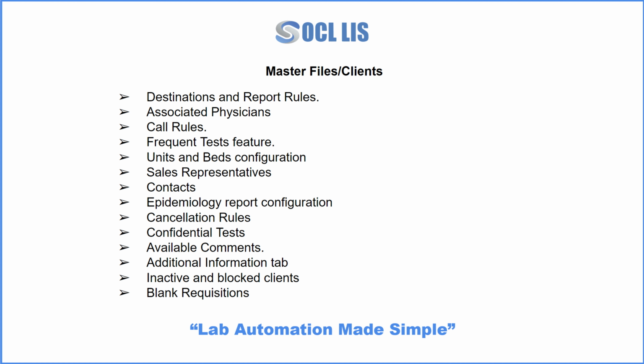Welcome to this tutorial. In this video, we will be exploring the various features and functionalities on the screen, which will help you manage and track laboratory information efficiently and accurately. Whether you're a laboratory technician, manager, or general user, this tutorial is for you. By the end of this video, you'll have a solid understanding of how to use this LIS feature to streamline your laboratory workflows, reduce errors, and improve the quality of your information. So, let's get started.